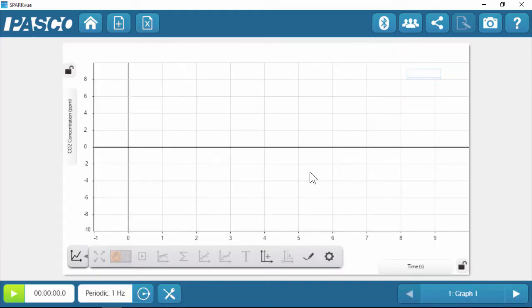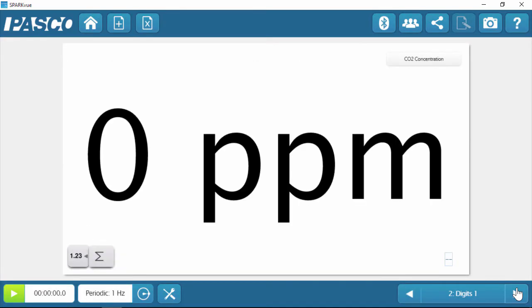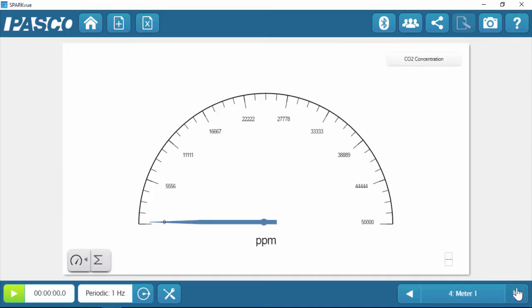To get started, I'll click CO2, which will build the basic data displays: a graph, digits, table, and a meter.